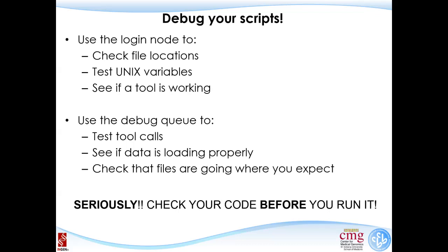So the next thing is basically debugging your stuff, right? So before you run anything, you want to double, triple, quadruple check all of this over and over again. You can test calls using your own terminal. So like samtools space whatever, if you're trying to cut reads from a particular file and print the output to your terminal. So that way you save some time. This can also help you make sure that the files are going where you expect them to go.